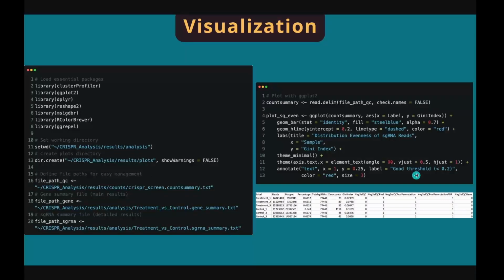We can visualize specific columns of the table using ggplot2. This is the syntax of ggplot2, where lines are connected by plus signs. Each line represents a layer of the plot. For example, the first line represents the data layer, where you specify which dataset and the columns you want to visualize in the plot. The second layer is a plot type layer, where you specify you want a bar plot, box plot, violin plot, or something else. All other layers are pure aesthetic.